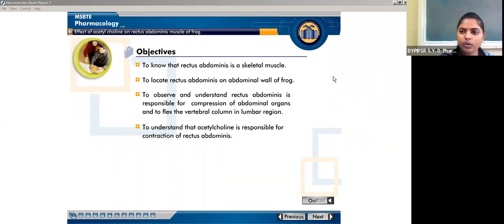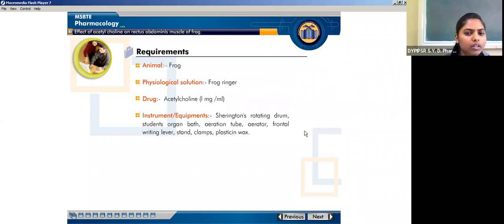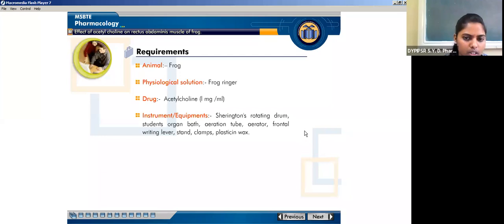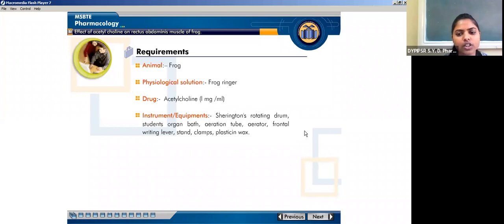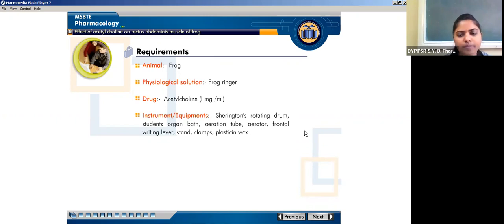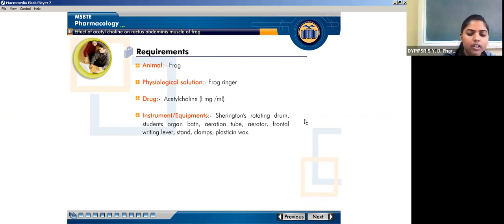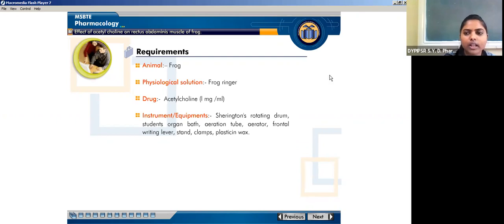For this experiment, the requirements are: the animal, which is the frog; the physiological solution, which is frog Ringer's solution; the drug, acetylcholine at 1 mg per ml; and the instruments — these include a student organ bath, aeration tube, aerator, frontal writing lever, stand, clamps, and plasticine wax.